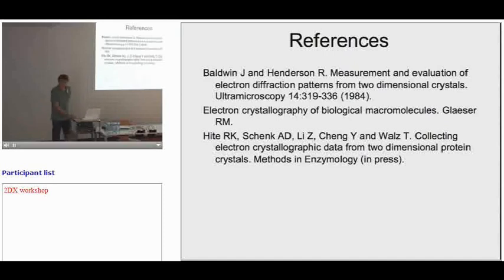Yeah, I didn't quite understand what you were doing. So you take first a diffraction pattern and then an image to check what kind of crystal form you have?